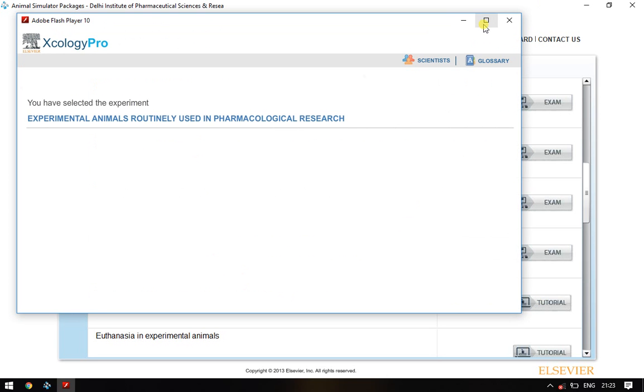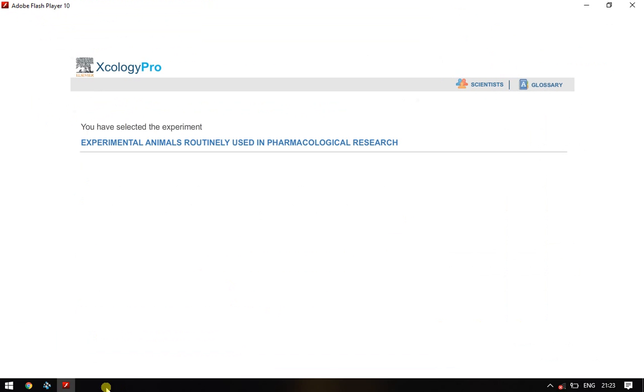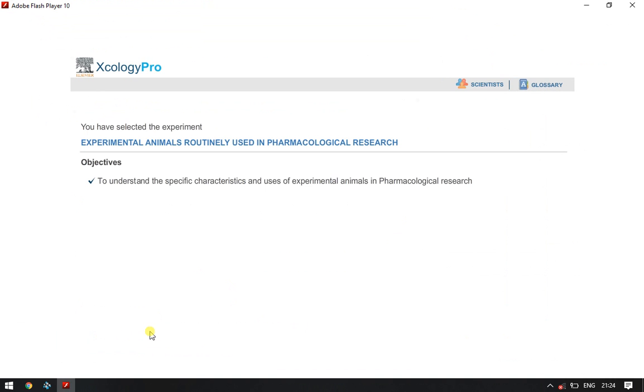You have selected the experiment: Experimental animals routinely used in pharmacological research. Objectives: to understand the specific characteristics and uses of experimental animals in pharmacological research. Click Next to continue.